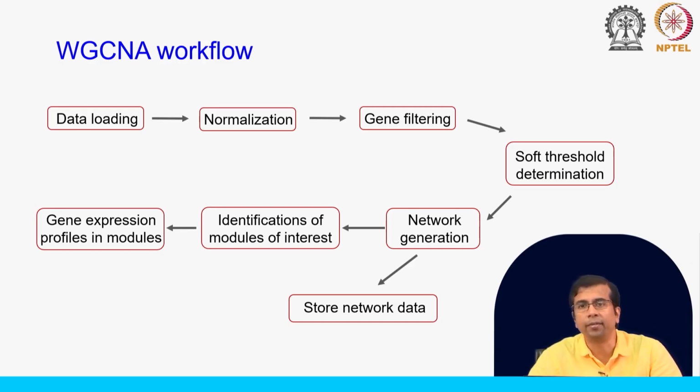So, the idea is that the genes that show the most variation after the variance stabilization method, right, the top 10% or 5%, are likely to be different between cancer and normal samples. Okay. But of course, we can actually do this gene filtering in different ways. We can do a proper differential expression analysis, find a list of genes, and then use that for our filtering purpose.